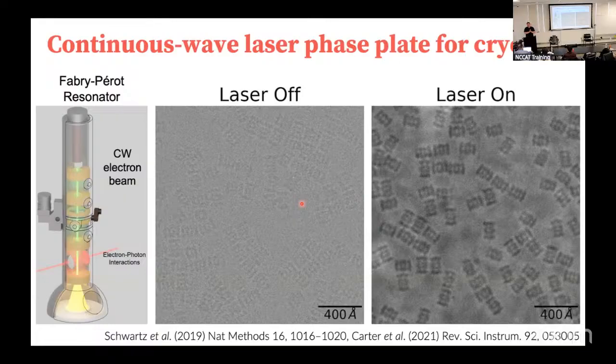The reason for that is that you've probably heard this week about the contrast transfer function. The CTF typically will start at 0, and then it will oscillate like a kind of exponentially decaying sine wave. That means at 0 focus, in any kind of phase contrast microscopy, you have no contrast. You can't really see the image. That's why if we want to find focus, we go to 0 contrast, and then we will slightly under focus in order to generate contrast.